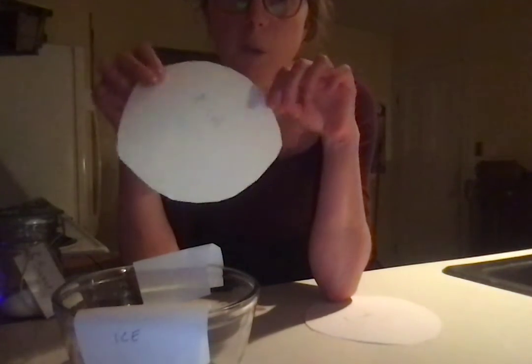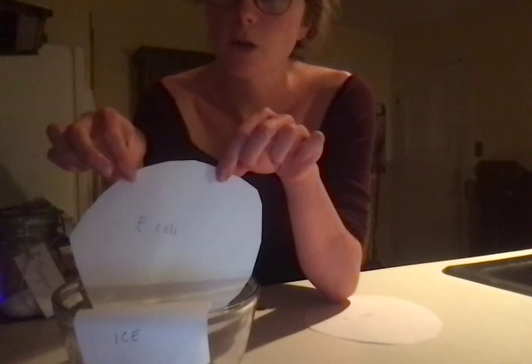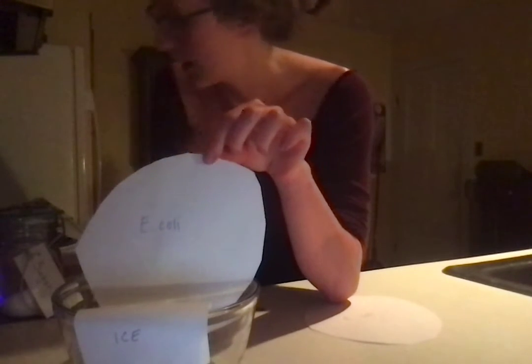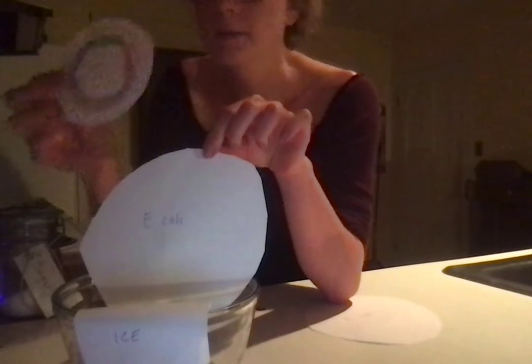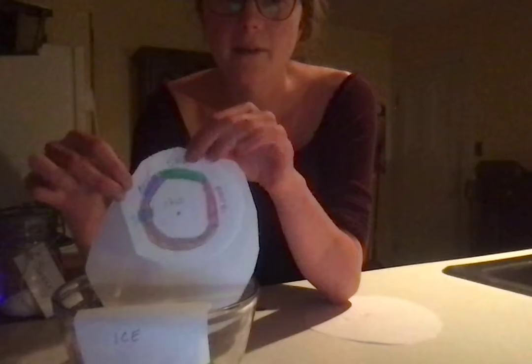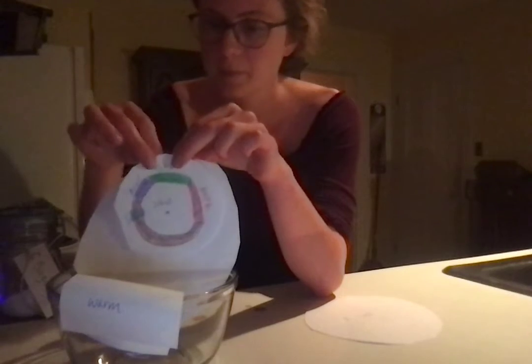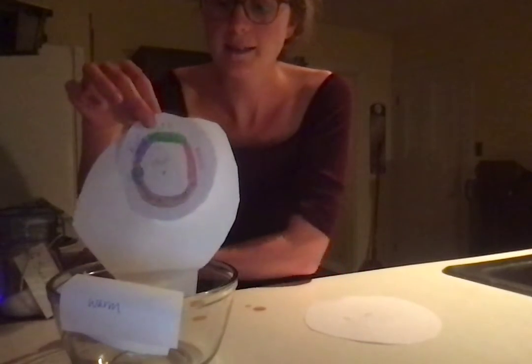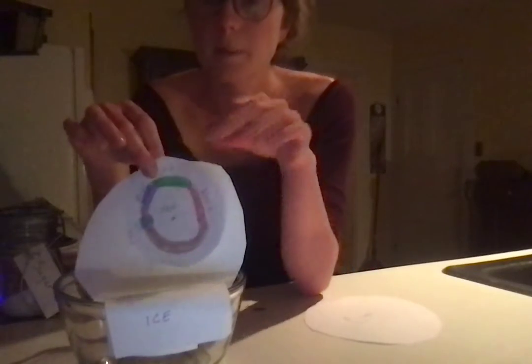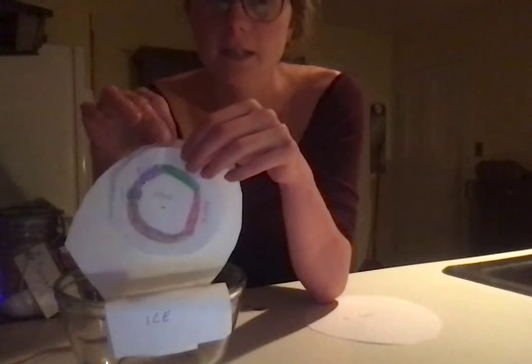So we'll expose the cells to the calcium chloride bath, and we will add the plasmid. And then we will take them out, place them in a warm water bath for about 1 minute. Then a minute passes, we take them out and we add it back to the cold water, the calcium chloride cold bath. And this is called a heat shock.